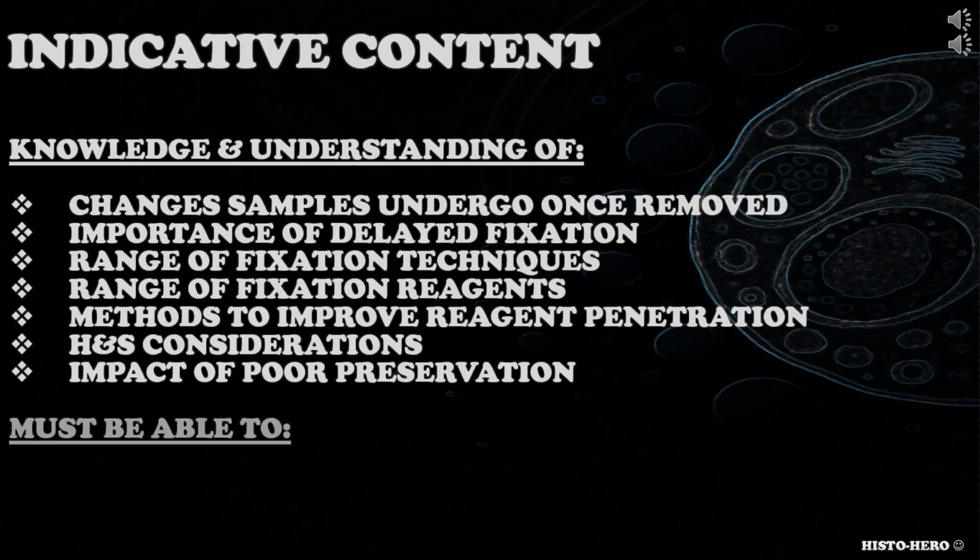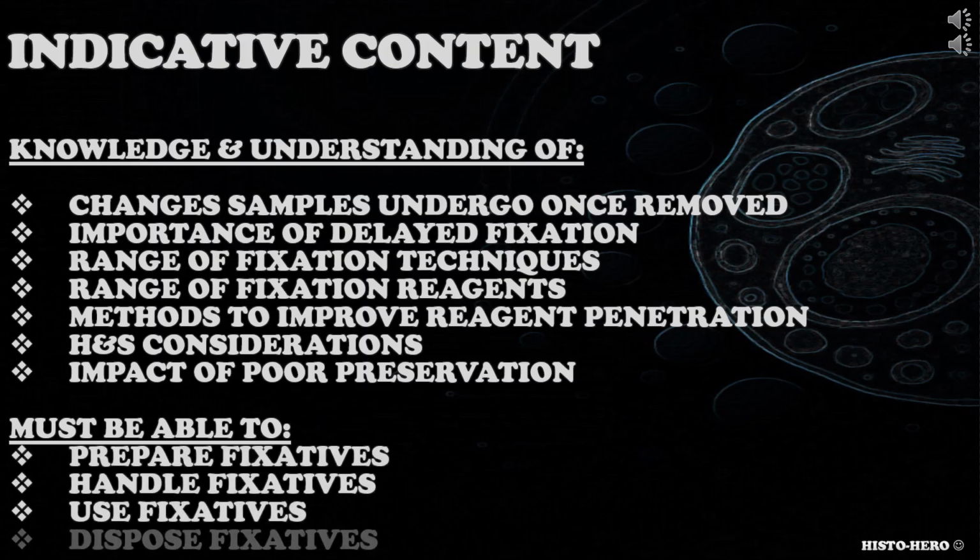IHC. Indicative content also highlights skills and competence the candidate is expected to be able to do. For this submodule, candidate must be able to safely prepare, handle, use and dispose of a range of fixatives commonly available within a histology department.